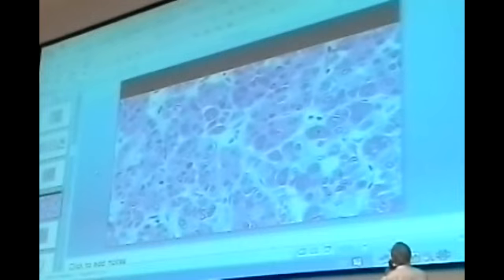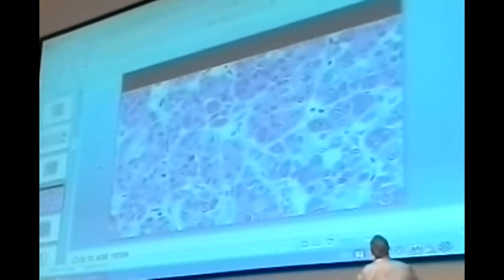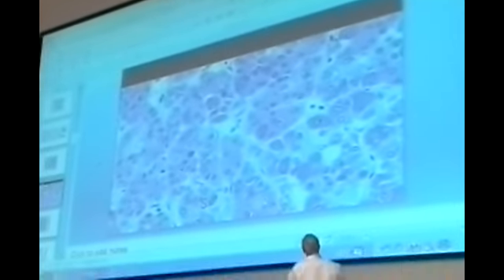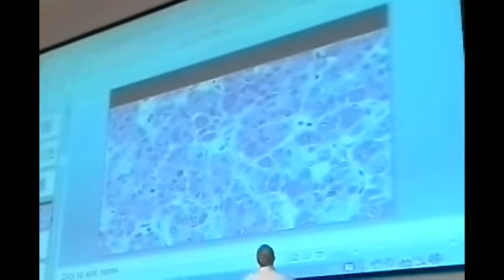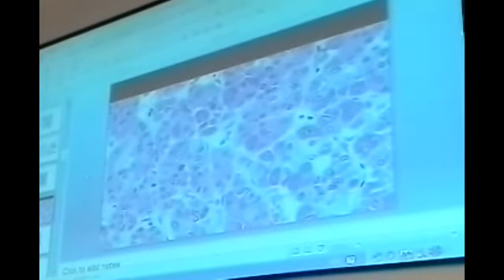Yes. So these are chromophils. These are acidophils. The large cells are acidophils. Basophils are large. Basophils are larger actually, but the reaction is not good here. It's good in front of me.